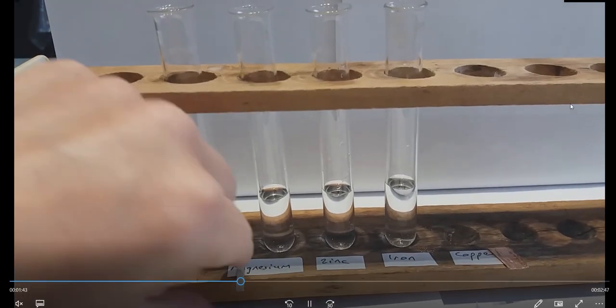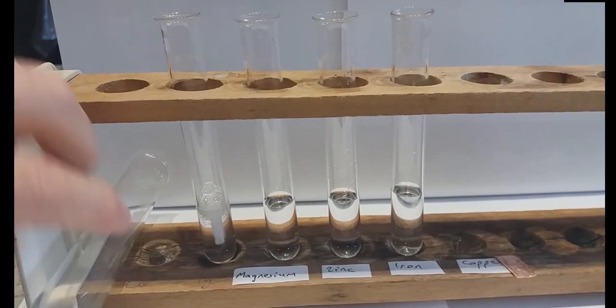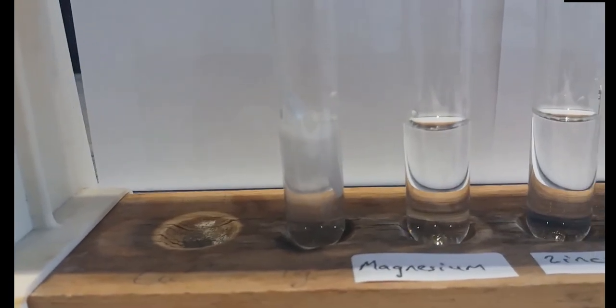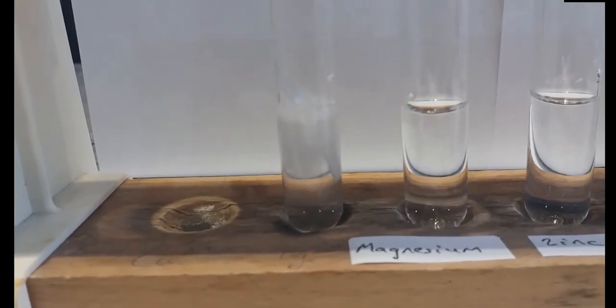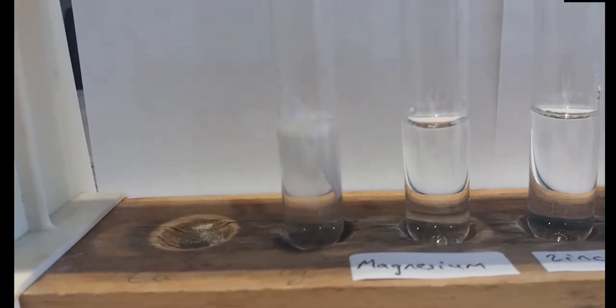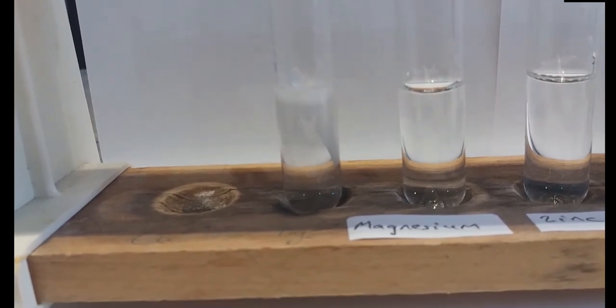So again, with a little bit of a reach there, we get the magnesium in, and this is just a little lump of magnesium, and look how fast that's reacting. So magnesium is way, way above hydrogen on the reactivity series. So magnesium and hydrogen sulfate, again once it focuses, becomes magnesium sulfate plus hydrogen. And you see lots and lots of bubbles being given off. Now you might have caught on there, I was putting a boiling tube over the top as we'd shown in the diagram. And in a moment you'll see the test for hydrogen.